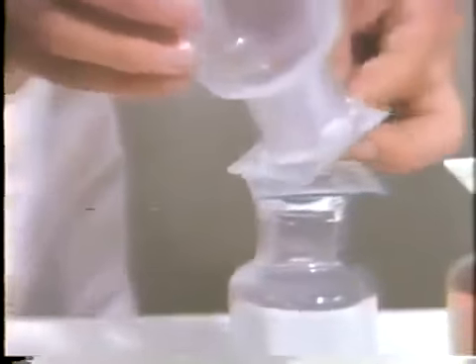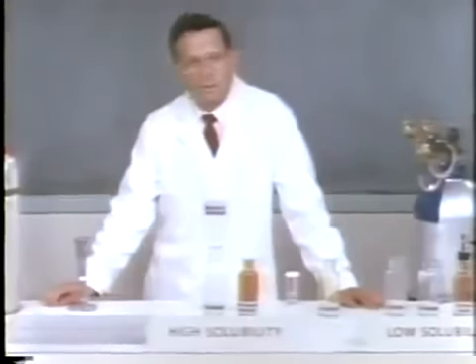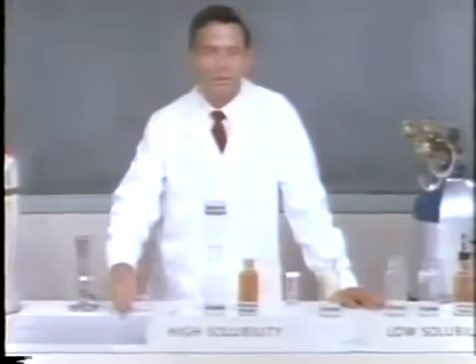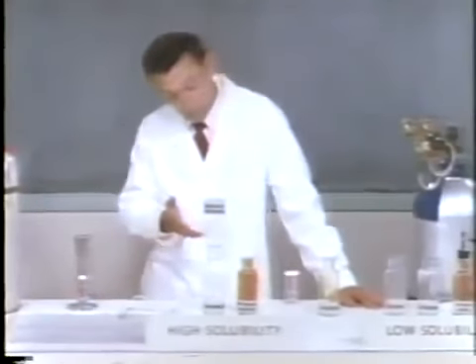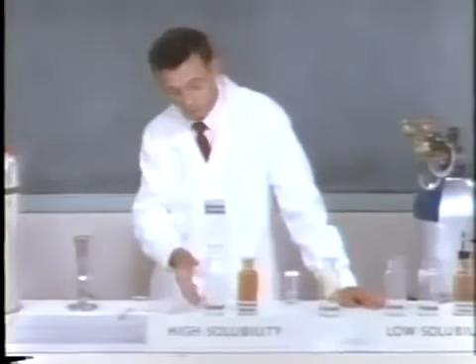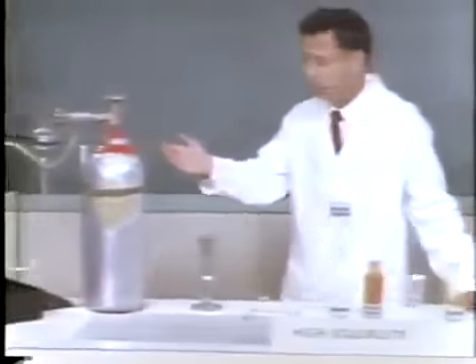What color would the dye be if the gases are mixed? Let's try it. Oh, we can't answer that. When these gases are mixed, we get a white smoke. So we can distinguish these gases qualitatively. We can learn much more about molecules by making quantitative studies. A quantitative study is concerned with the question, how much? For example, how much hydrogen chloride gas will combine with a fixed volume of ammonia gas to form this white solid? This apparatus is suited to such a measurement.